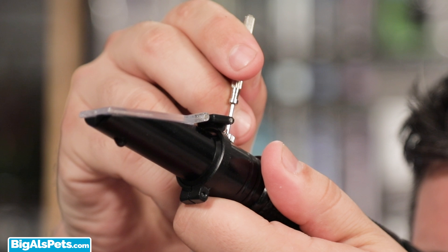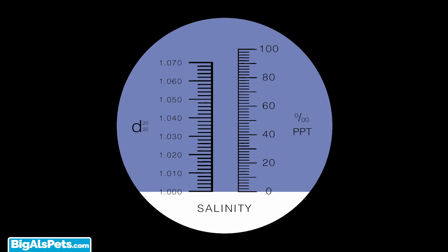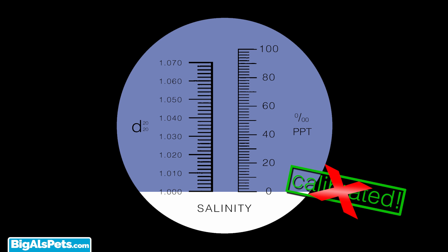Now, most people stop here, believing that their refractometer is calibrated. This is not true. For accuracy, we're going to proceed to the next step.